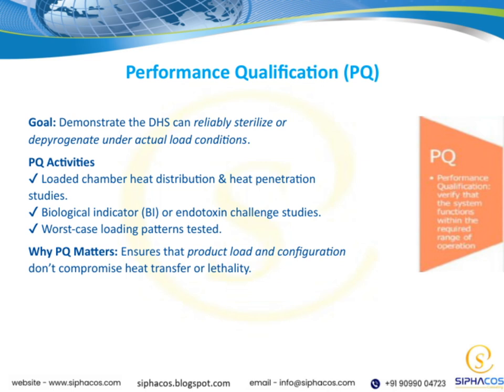We also test worst-case loading patterns. This means we deliberately load the chamber in ways that are most challenging for heat transfer, ensuring the process remains effective even under less than ideal conditions.